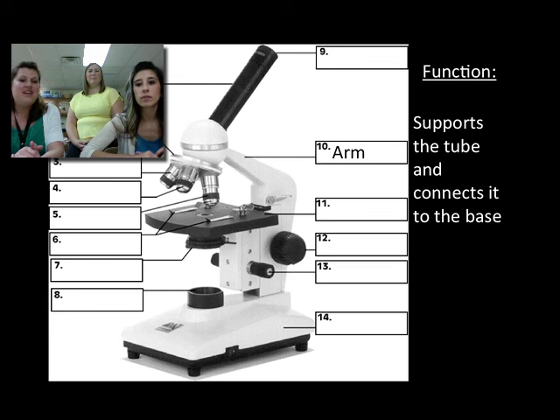This is the arm. We also spoke about this in the previous video - you're supposed to hold one hand on the arm to pick up and one hand on the base. The arm supports the tube and connects it to the base of the microscope.